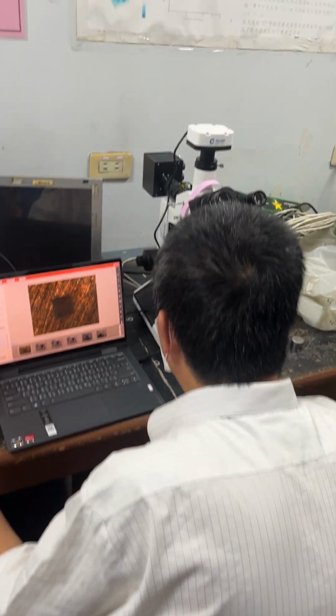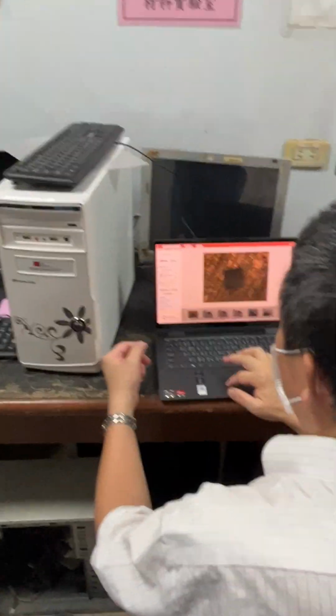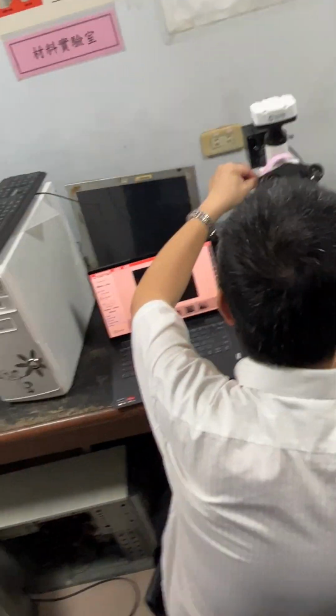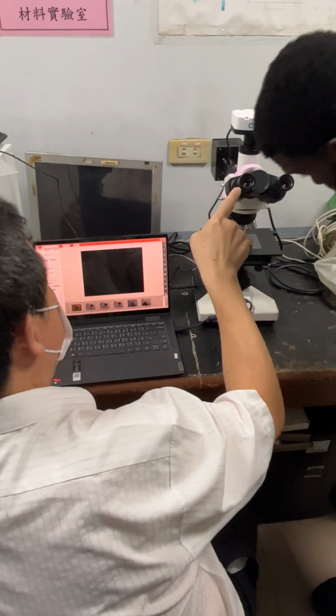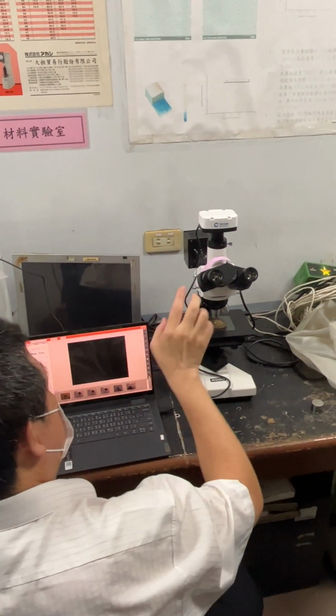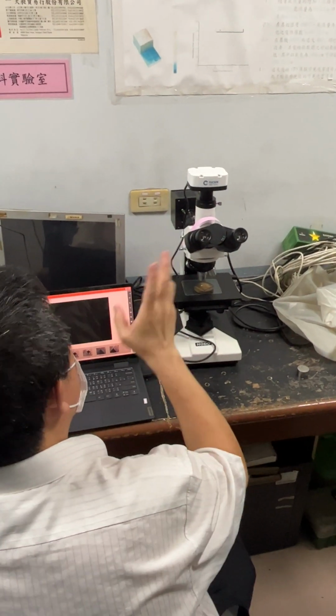This is the image over here. And for the image, first, for example, if I move this to here, you may come here and look by your naked eye, and you can either show this on the computer screen or by this scope, and either way.